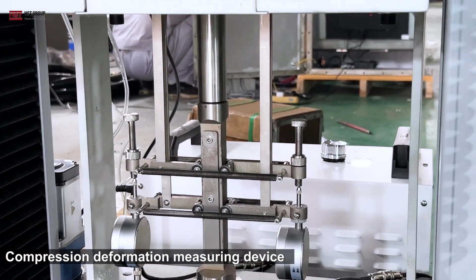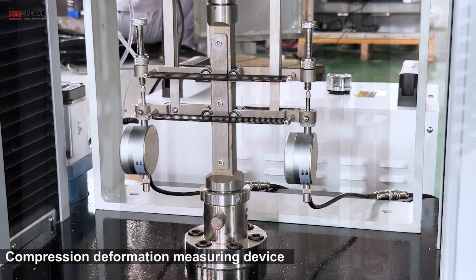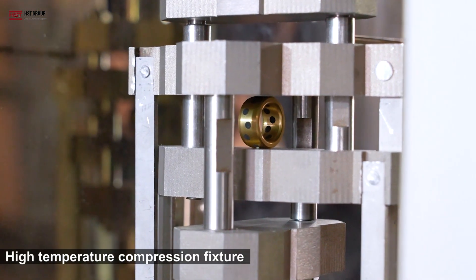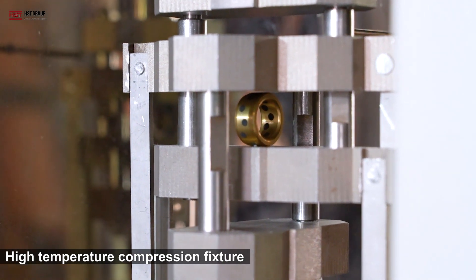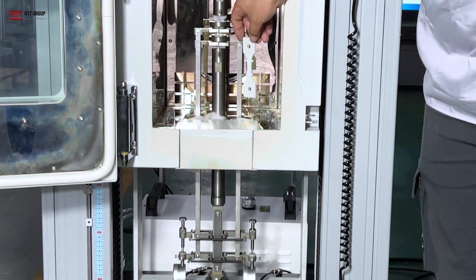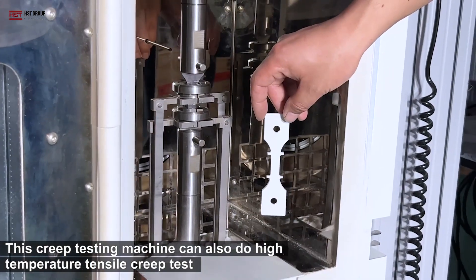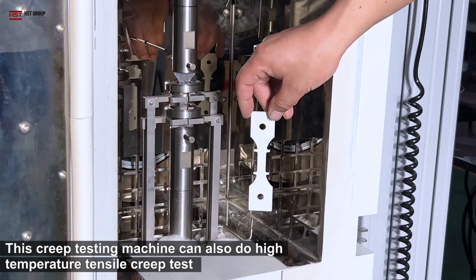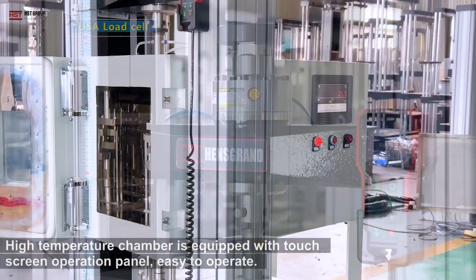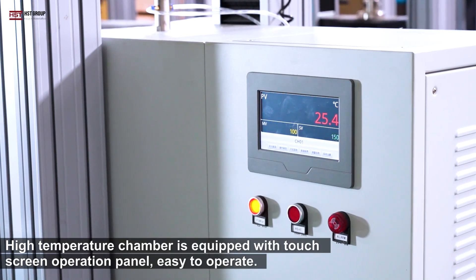The machine features a compression deformation measuring device and a high temperature compression fixture. This creep testing machine can also do high temperature tensile creep tests. It is equipped with a USA load cell, and the high temperature chamber has a touch screen operation panel, easy to operate.